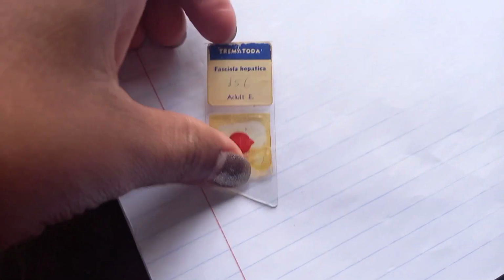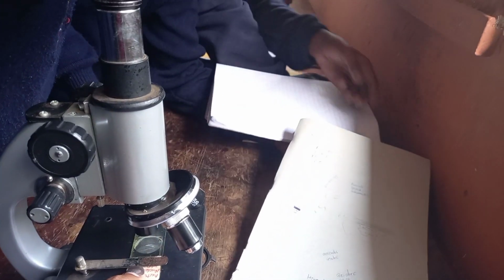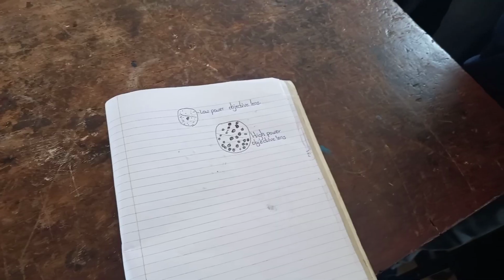It is a trematode, Fasciola hepatica, and it is red in color. Then you place it here. For starters, that's okay. You are learning how to use a microscope. Even if you have seen it, where is the field of view? This one is not in the middle. We said you place it in the center. Instead of using the low power objective lens, now you use the high power objective lens.